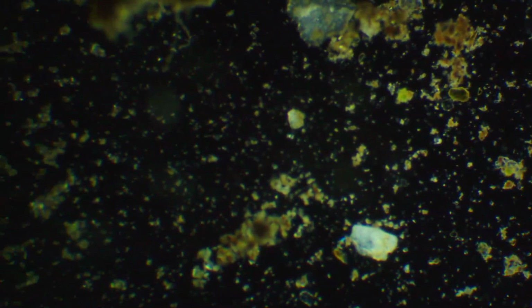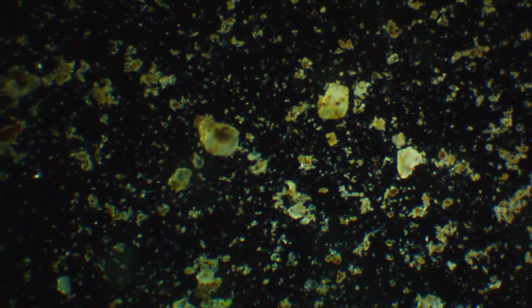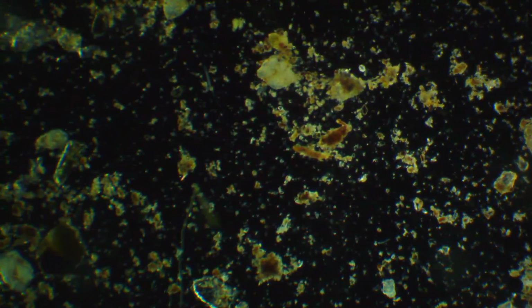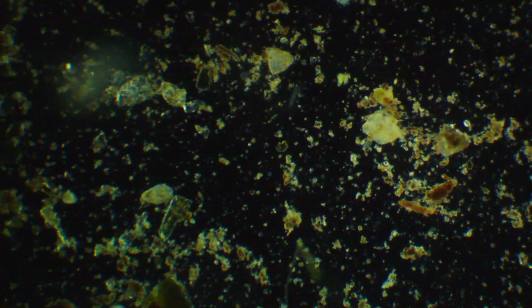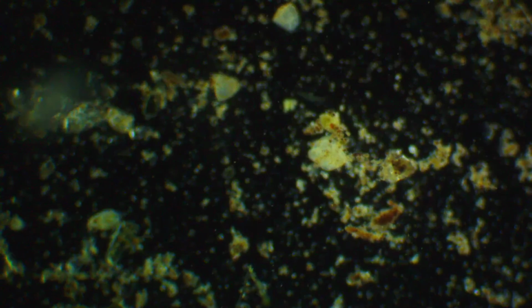Normally I take the sample from this main patch of moss that's in here, and I get a lot of worms and other soft body things. Oh look, there's a swimming worm-like thing. See that? Right there. And of course he's going to be hard to track too, but he's not going very fast. He's just swimming in all the different levels of focus, of depth of field here.